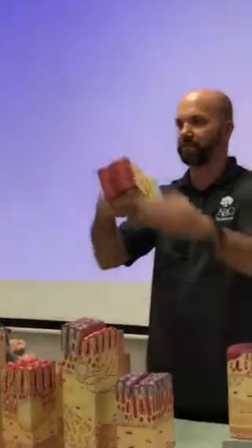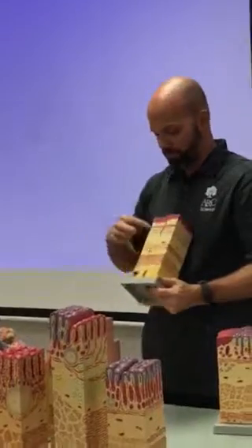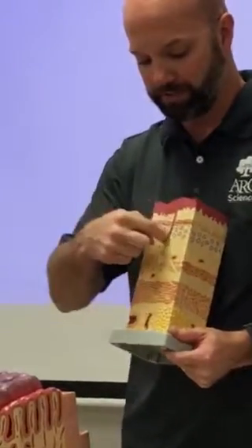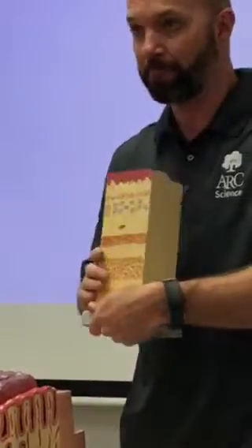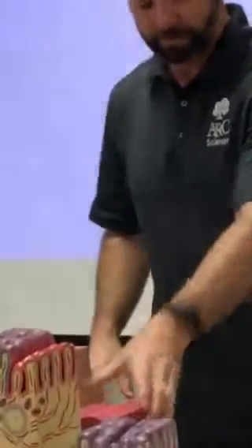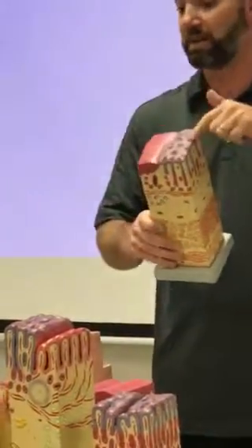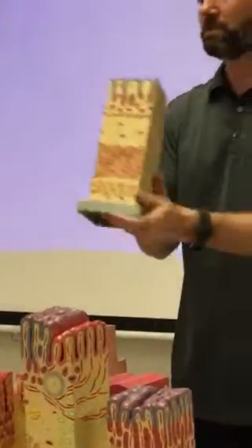Stratified squamous, flat, must be esophagus. Little adipose here. Adventitia at the bottom, no serosa. Submucosal glands with a duct to get the secretion to the surface. What are these submucosal glands called? Esophageal glands. What do they secrete? Lots of mucus. So we've got a little bit of that, and then we've got a little bit of this. So this is the transition from esophagus to stomach. So we're at the transition.